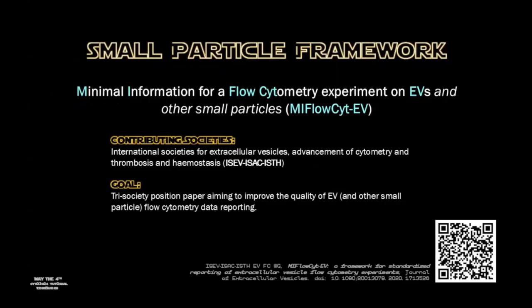So one of the key reporting frameworks for small particle flow cytometry is MIFlowCyt-EV. And this is an extension of the cellular standardization and reporting practices paper, MIFlowCyt. And it came around from a group of researchers spread internationally between the societies of extracellular vesicles, the advancements of cytometry, and thrombosis and hemostasis, that were self-proclaimed gurus with small particle analysis.